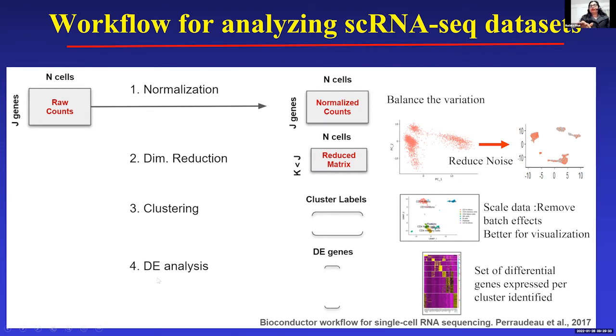And then we do differential analysis to annotate which cells are which cell type. There are some signatures that are unique for one cluster. For example, in this heat map, you will get to know the enriched set of genes for one particular cluster, which will help you annotate iteratively which cell type they might belong to. That's why these signatures are only specific to this bin or this cluster of cells.